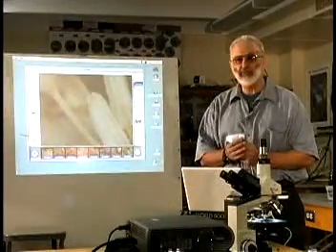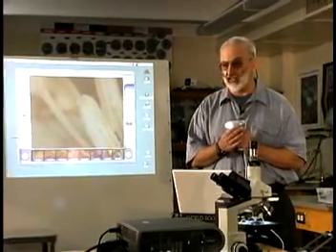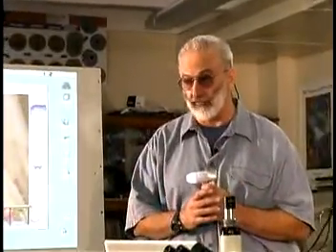Okay, class, when you're using the microscopes, you want to start out with your lowest power, your 50x lens. That will give you an overview, and it also gives you your largest field of vision. When you spot something that you want to look at, and when we dissect the flower, we'll switch over to 100 power. That will give us a much closer image, a smaller field of vision, but we'll be able to see in more detail. Lastly, when we're looking at pollen grains or internal structures, we'll probably want to switch one more time to the 200 lens, which will give us our best magnification.